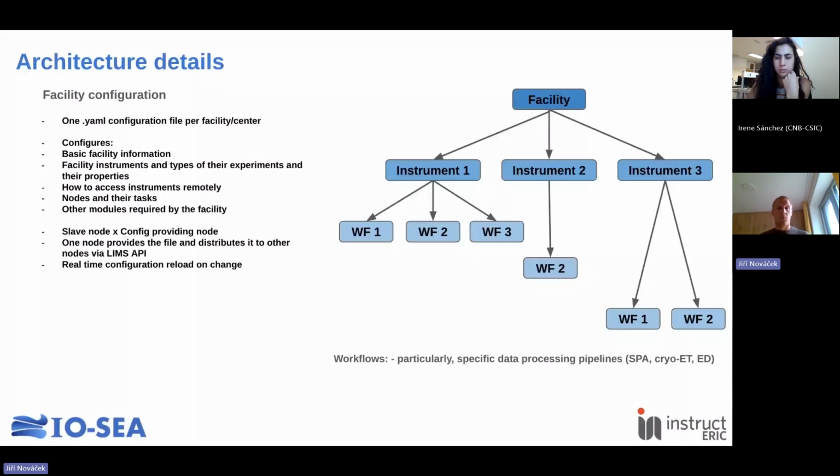So now, more from the user perspective, what I will try to show you is that even though this is now set up for the EM facility, it can be easily changed to any other type of facility. The standard configuration is performed through a single configuration file. We use a YAML format, so it is a single YAML file that configures how the facility and all its resources are set up.